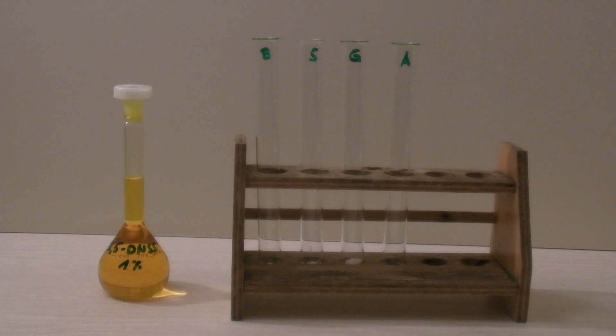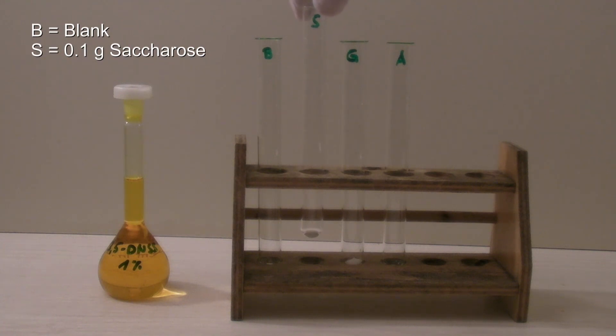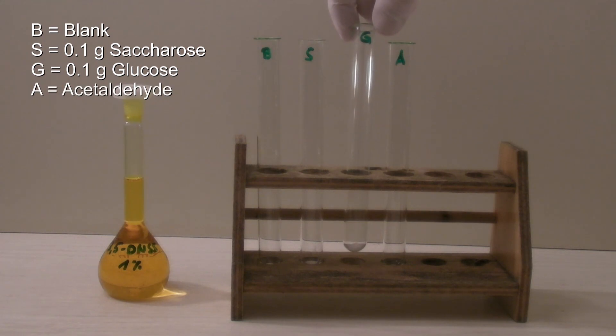Next, four test tubes have been prepared. The first one was a blank and contained nothing. The second one contained 0.1 grams of saccharose. The third one contained 0.1 grams of glucose. And to the last one, a solution of acetaldehyde will be added.